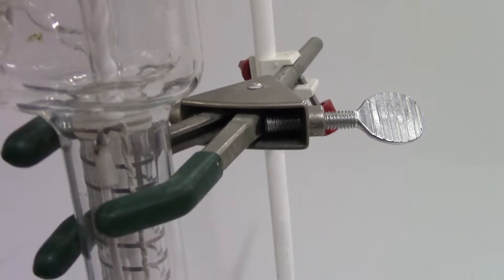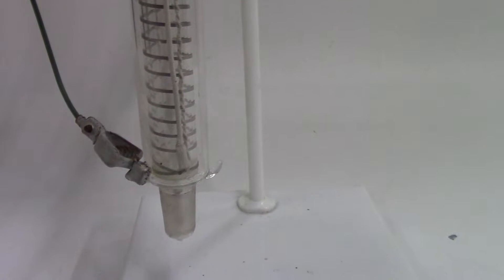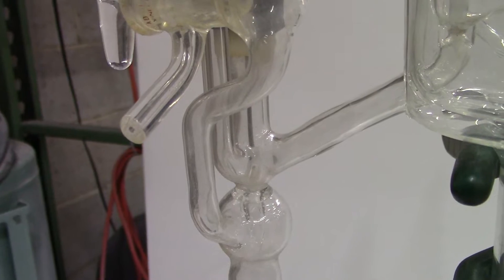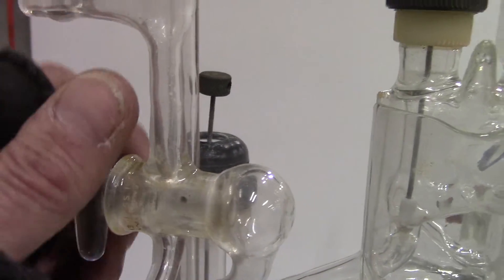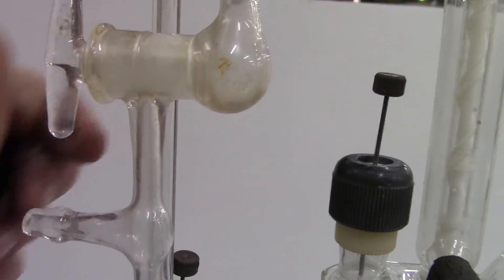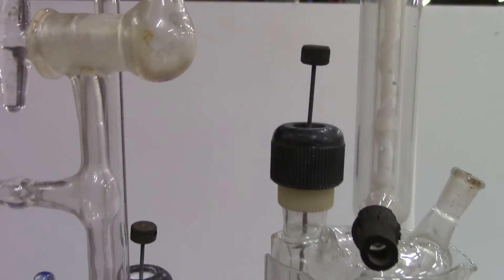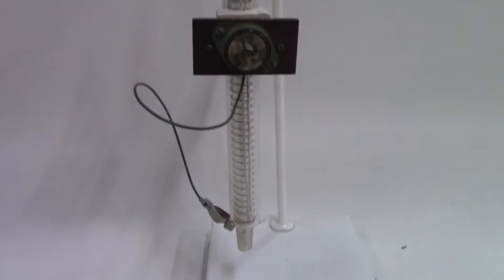The stirring rod is in there, as you can see right there. The spinning band looks to be in very good condition. This one measures 29 inches in total height from the very top to the bottom.